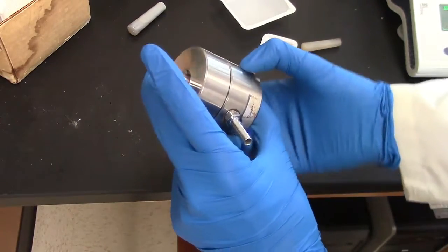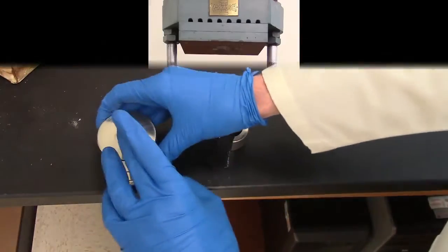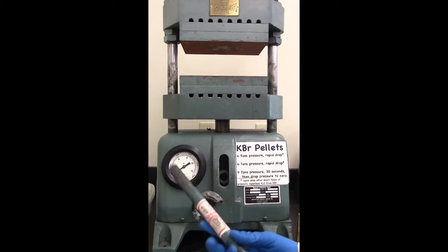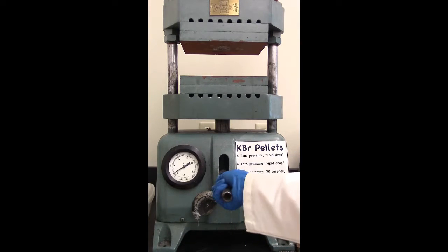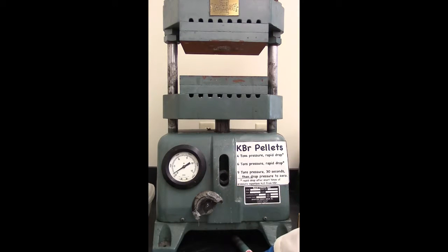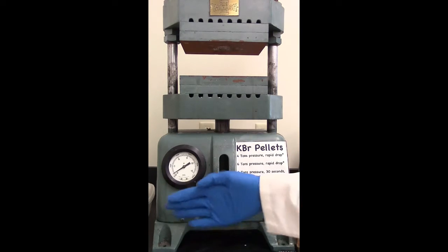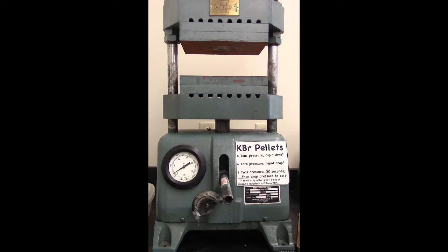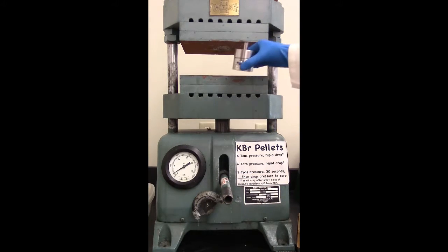Now we're going to put it into the KBR press. So this is the KBR press. You can see here that it has some instructions on how to make a KBR pellet. So you're going to stick this bar handle into the slot here. When you're finished with this, this should always come out so that nobody walks up and stabs themselves on that.